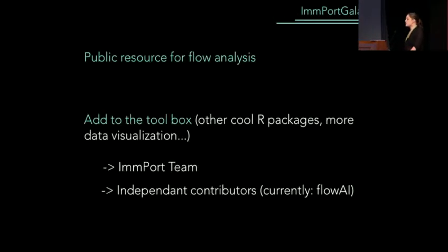All right, so again, we want this to be a public resource for flow cytometry analysis, and we really want to support high-throughput analysis because it's really going towards that. Eventually, we do want to add to the toolbox because there's a bunch of other cool R packages that could really be in there. We also plan to do, we would like to do more work on data visualization. Everything is dependent upon funding, obviously.